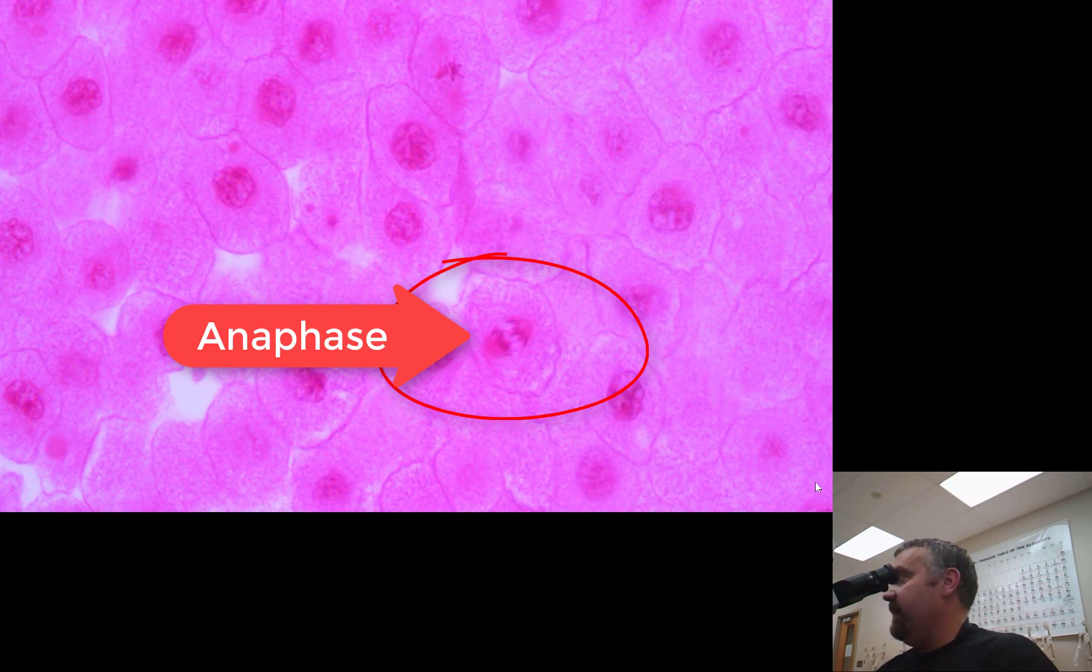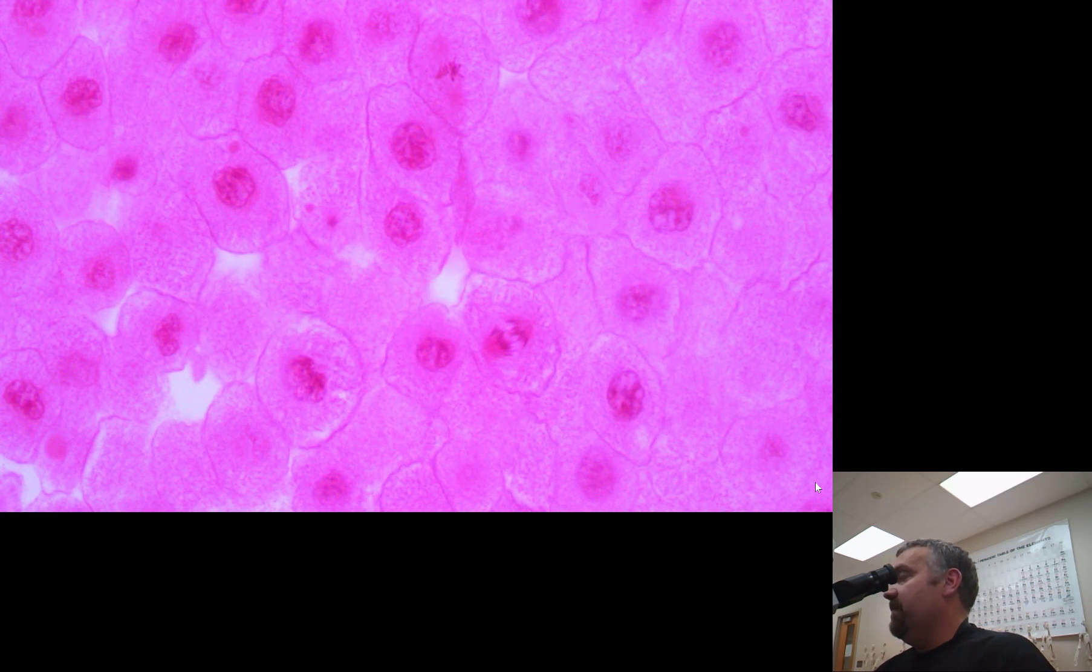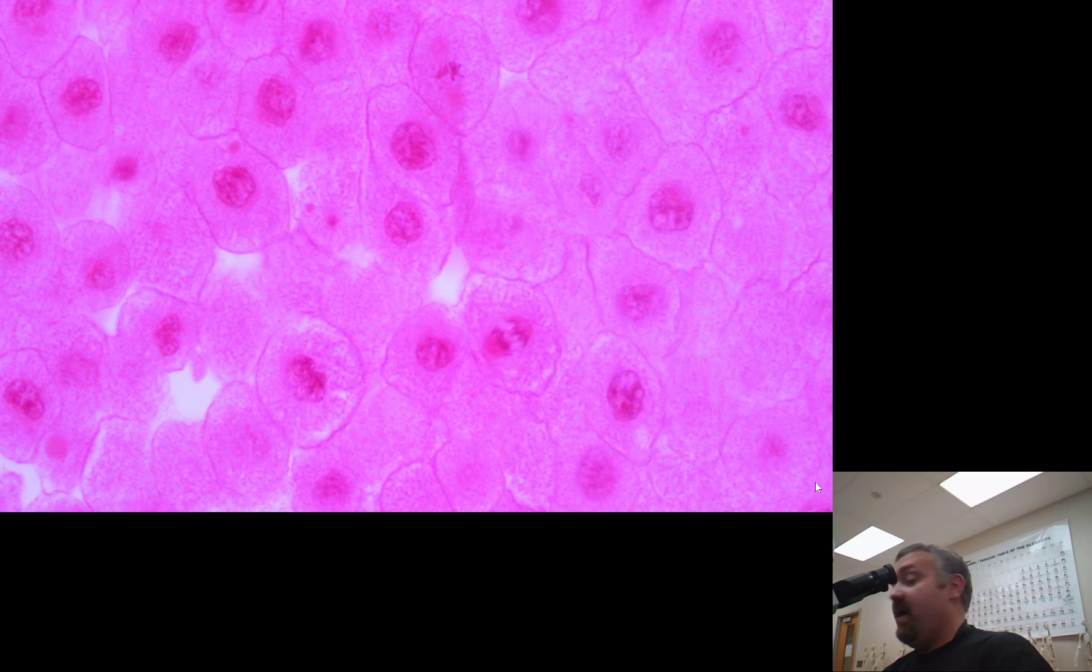Just quickly, this is not the reason for this video, but during prophase, the nucleus would disappear. During metaphase, the chromosomes will line up at that equator, the metaphase plate that I just showed you. During anaphase, the chromosomes will be pulled apart into two separate piles. And then during telophase, two new nuclei will form.